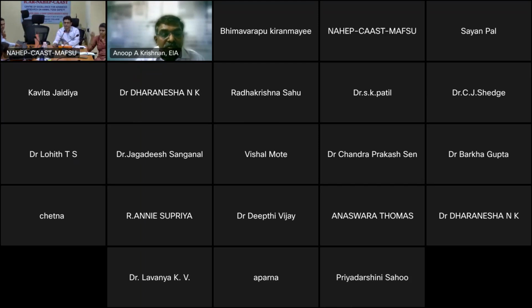Sir, one question from the participant. Sir, I wanted to ask, you said that we reduce the sample size to reduce the matrix effect in extraction. If we reduce the sample size too much, then the dilution factor will go low, and then our final values will be affected or not?